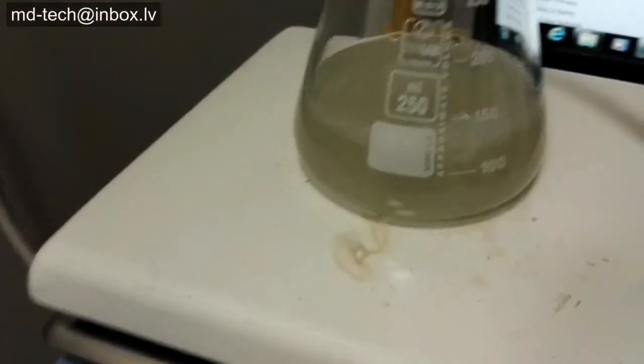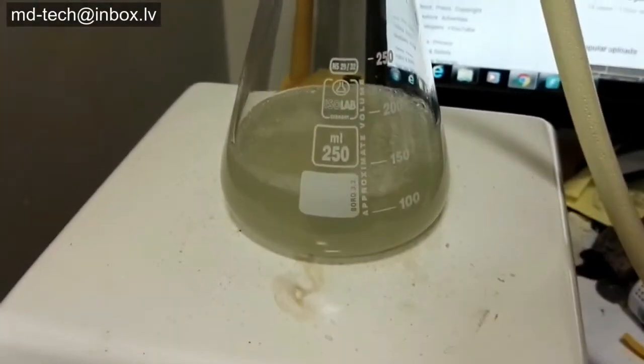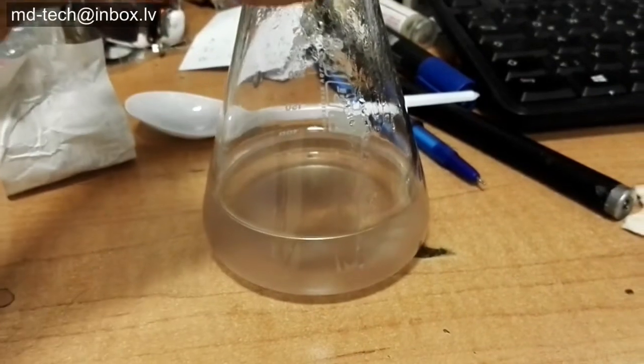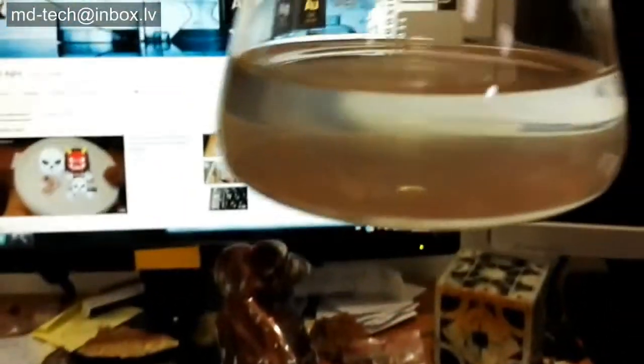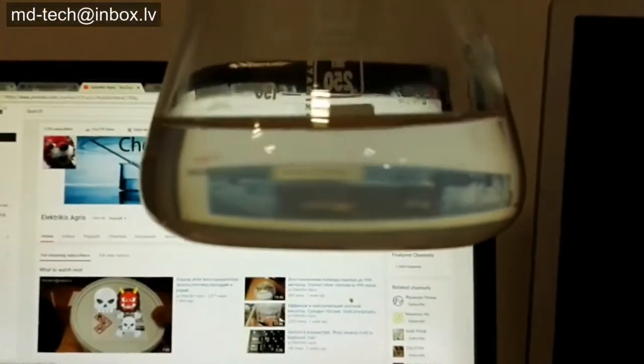In solution forms colloidal gold particles. In this solution is a very small amount of gold.